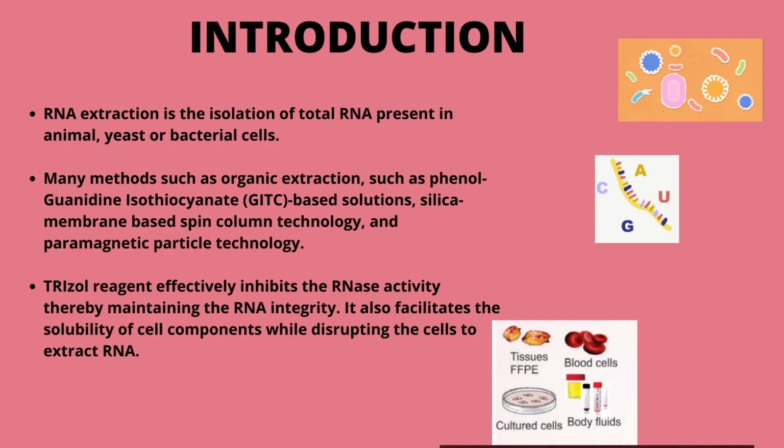But the commonly used method is TRIzol extraction because it is sensitive and gives a high yield of RNA. The TRIzol reagent effectively inhibits RNase activity, thereby maintaining the RNA integrity, and it facilitates the solubility of the cell components by disrupting the cells to extract the RNA.